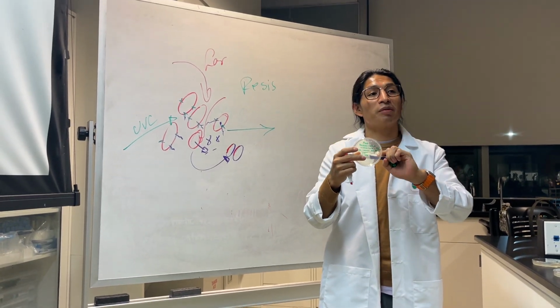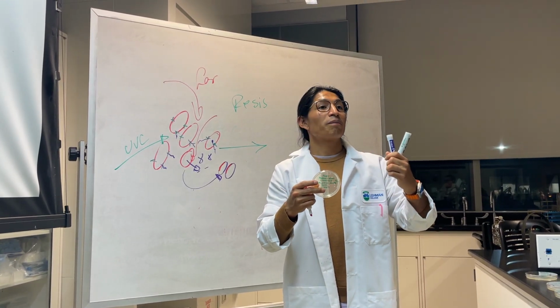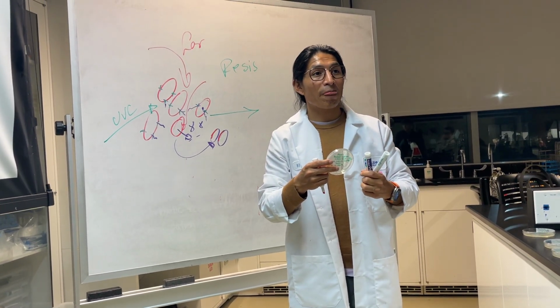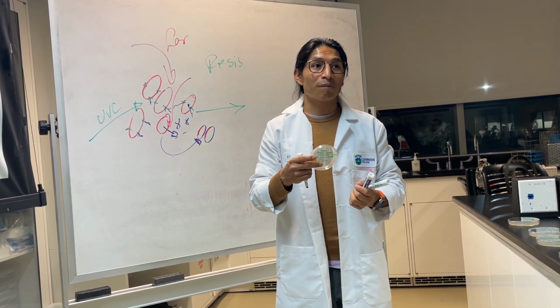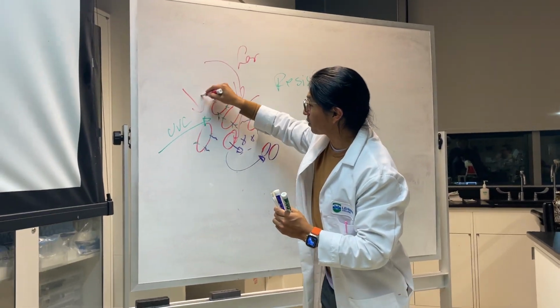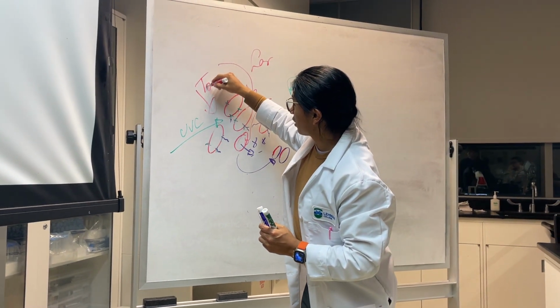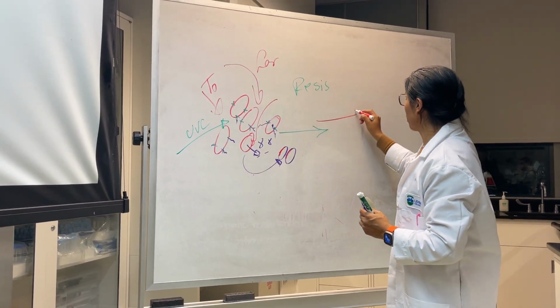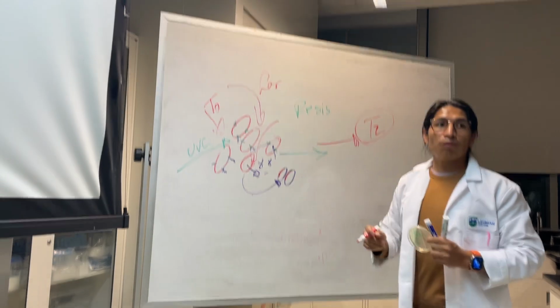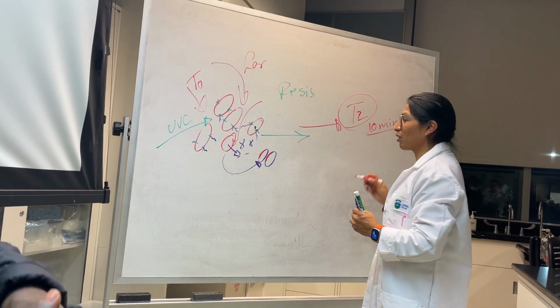So this is this petri dish and what you have, very similar in the instance. But it also has to do with the species. Some bacteria, for instance, E. coli or Bacillus subtilis, could be by itself resistant to UV light. Now it comes down to exposure time, right? So I can also say, okay, this is true. This is one possibility. This is T0 time. Now what will happen if I go to T2 time? Instead of 4 minutes, I say 10 minutes. What will be the outcome of this?